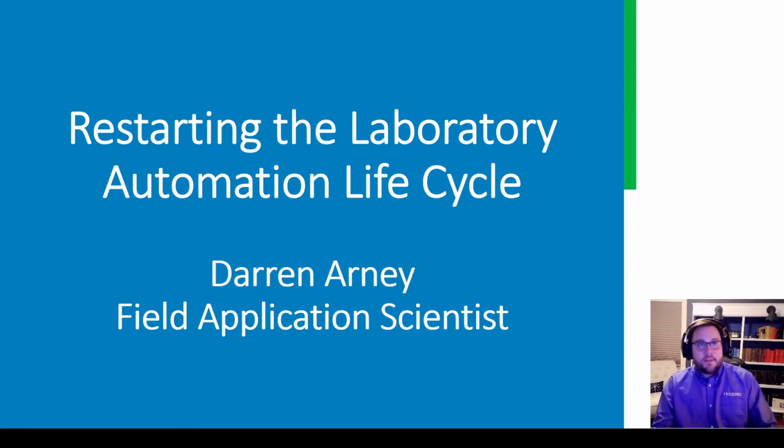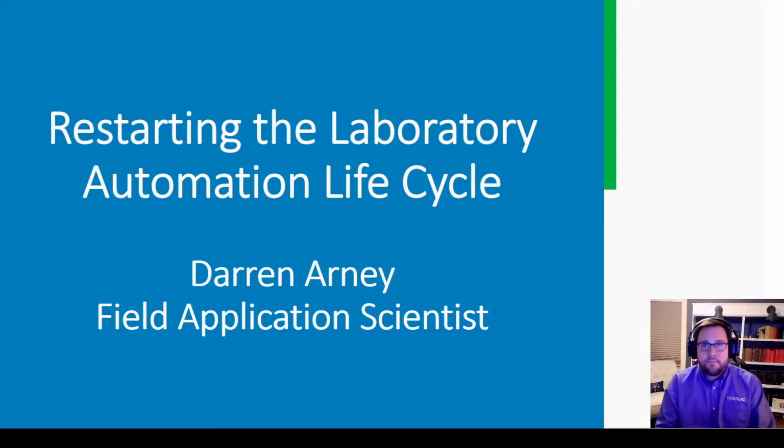Now in this talk we'll discuss a few examples of the specific challenges and solutions relative to reintegrating legacy workhorse automation systems that can provide the benefit of a familiar user interface for researchers, reduce costs and downtime relative to designing, installing, and validating entirely new automation systems, and the benefit of the collaborative process that comes from working start to finish with myself and the many other members of the Biosero team.